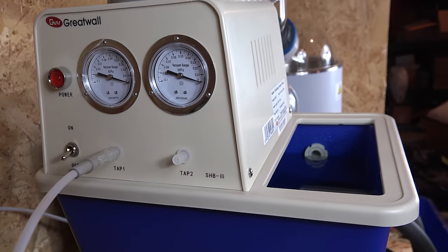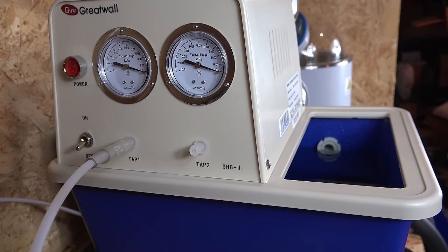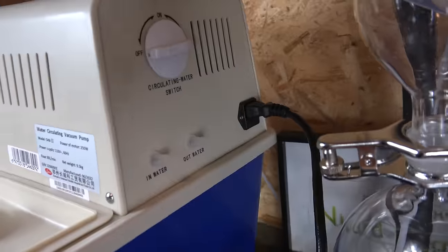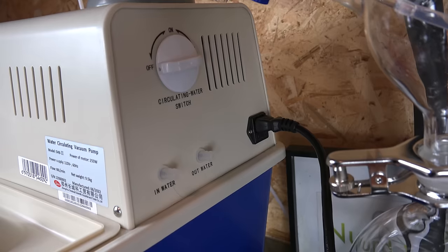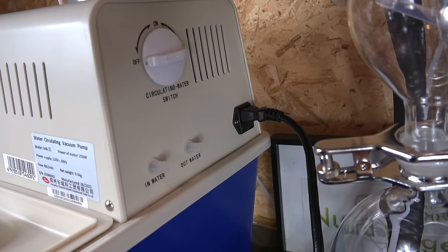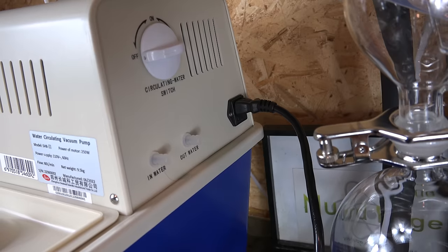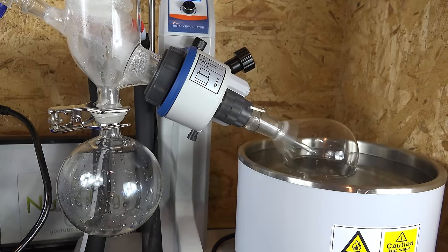Over here we have the vacuum gauges. The actual vacuum level isn't all that important since we're not doing fractional distillation, but these are very useful for figuring out if you have a vacuum leak — if so, there might be a loose connection or broken seal somewhere. This particular unit also has a water recirculating pump. The idea is that this one unit can be connected with the condenser to provide both water cooling and vacuum pumping with the same reservoir. I'm not using that function because I have a separate water chiller, but it's an option if you don't need to rotovap very low boiling point solvents like diethyl ether.